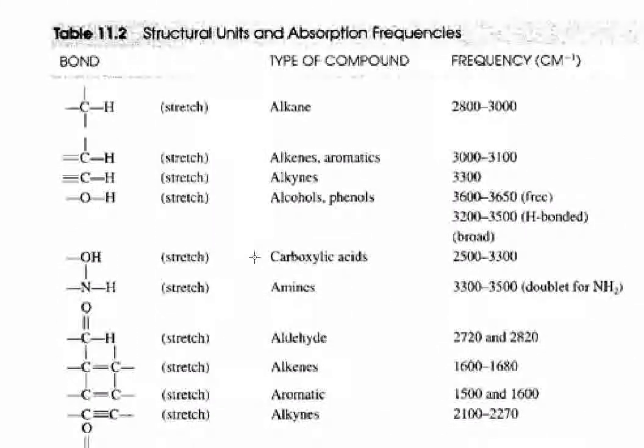All right, let's look at some of the specific bond entries. We'll start at the top. An alkyl CH has an average stretching frequency in wave numbers of 2800 to 3000 reciprocal centimeters. Now remember this value 3000, it's important. If we examine the stretching frequency of an alkenyl CH, we note that it's at a higher frequency, from 3000 to 3100.